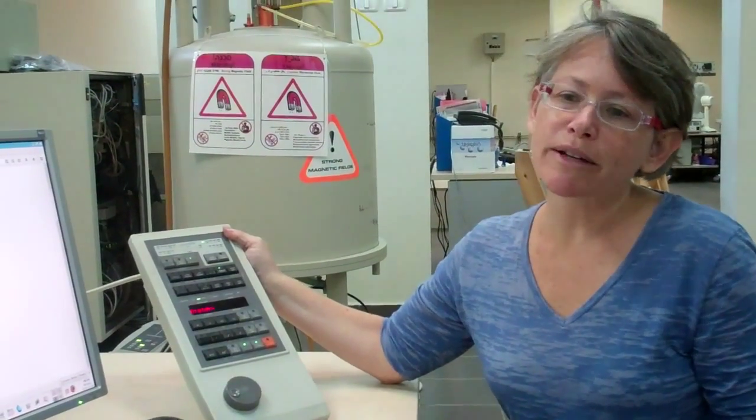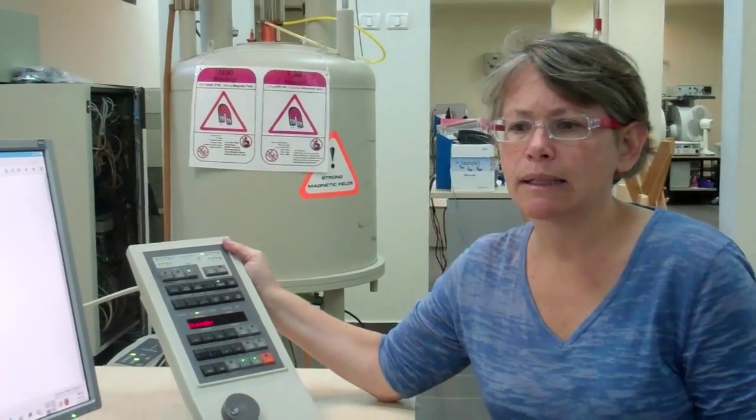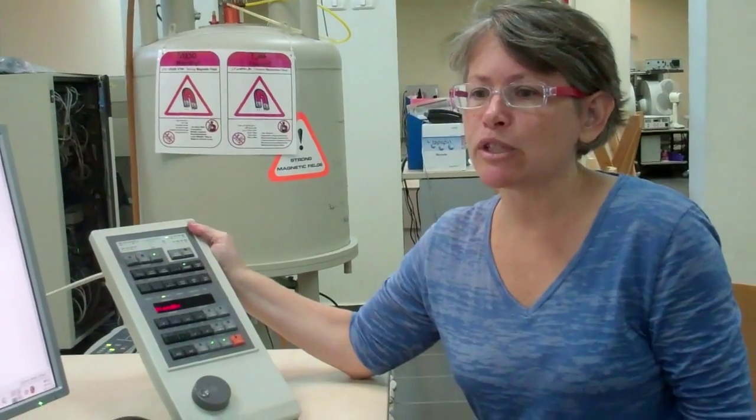For standard pulse-acquire experiments on the 200 or 300 megahertz spectrometers, we usually spin. The spin rate we use is 20 hertz.